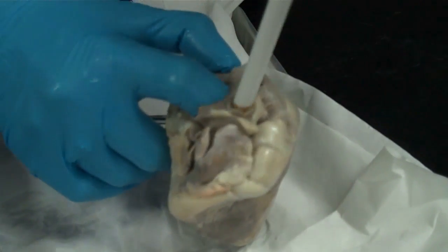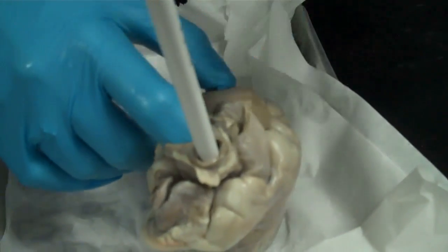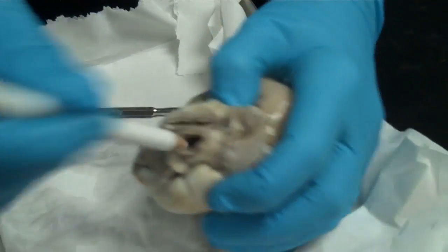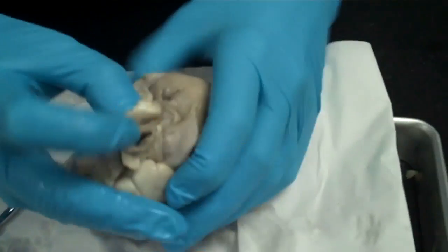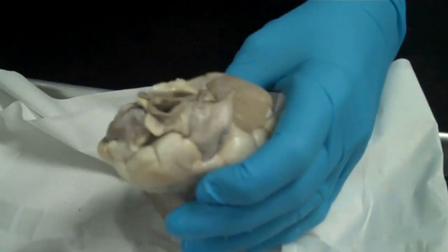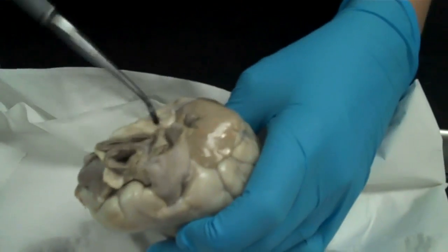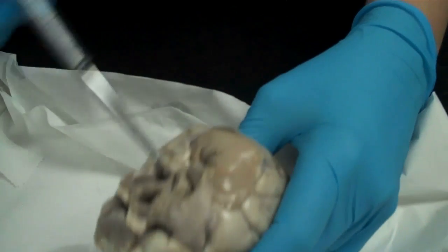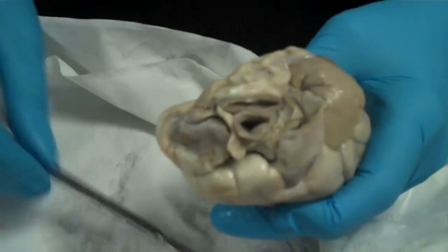This little branch of the aorta right there is called the brachiocephalic. On some hearts, if the aorta is cut too low, you don't see the brachiocephalic. But on this one, you can see the three vessels on the top of the heart: the pulmonary artery, the aorta, and the brachiocephalic.